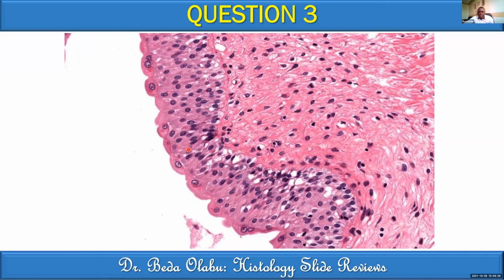How exactly did you tell that this is not pseudostratified if 6 was pseudostratified? Okay, good question. We clarified, except perhaps that was the time your mic also gave you trouble. So we said that you divide the epithelium from the basal side to the apical side into zones. Then look at the distribution of the nuclear layers.